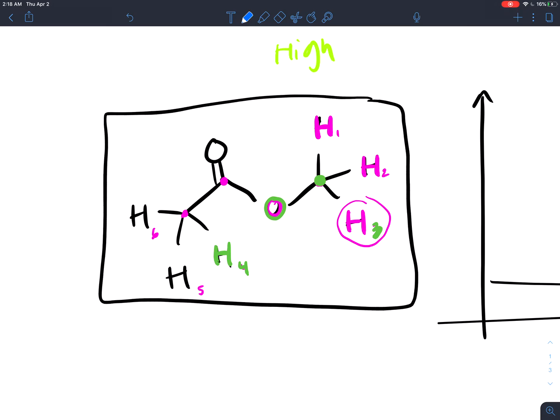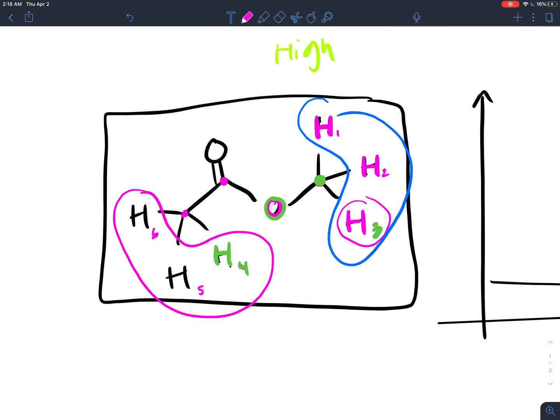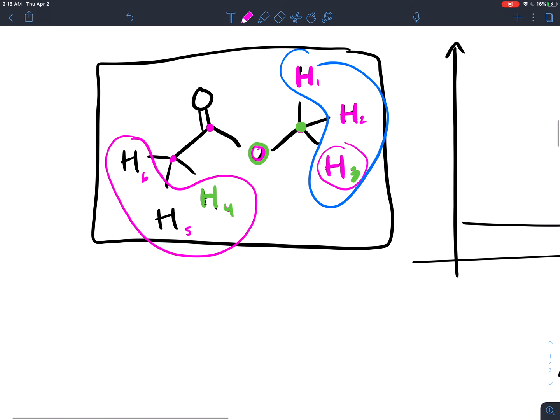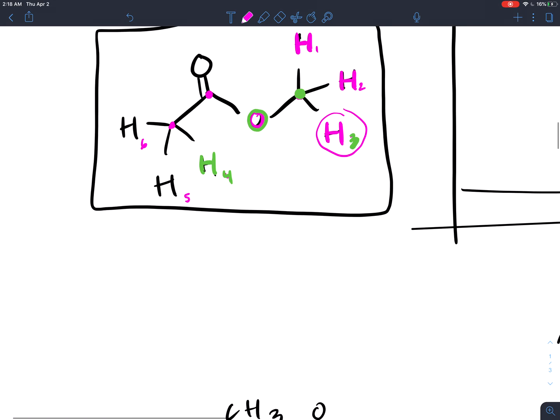So what are my equivalent hydrogens? Again, I have these 3 to be equivalent, and I have these 3 to be equivalent. So here's a quick tip that everyone gets to know: most CH3s are usually equivalent. The 3 hydrogens on a CH3 are most of the times equivalent. Not always, but most of the times. So if I'm gonna just redraw this, I have an oxygen, then I have this that says CH3. So those 3 hydrogens are equivalent, and those 3 hydrogens are equivalent.